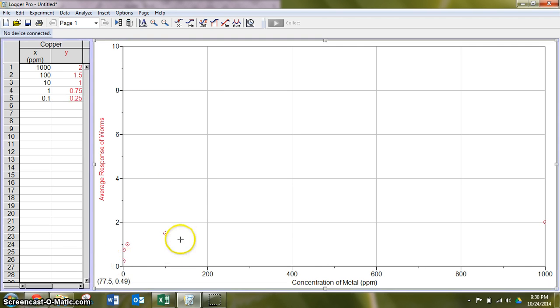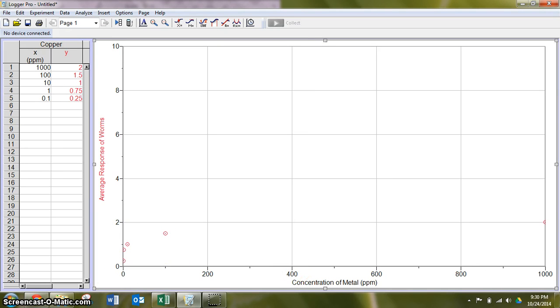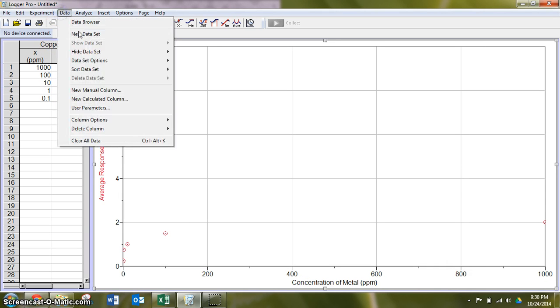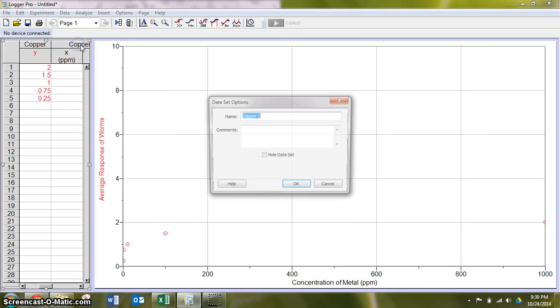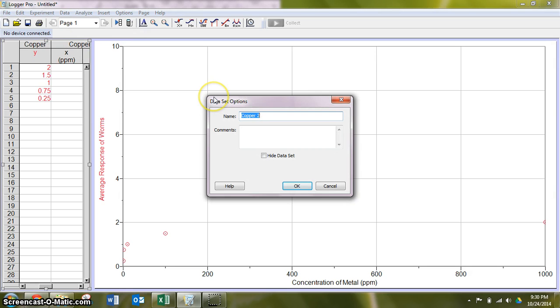As before, you'll notice that they are kind of bunching together here because of our difference in scale. This time, what I'm going to do is go to data, new data set right away. And we're going to label that our zinc.